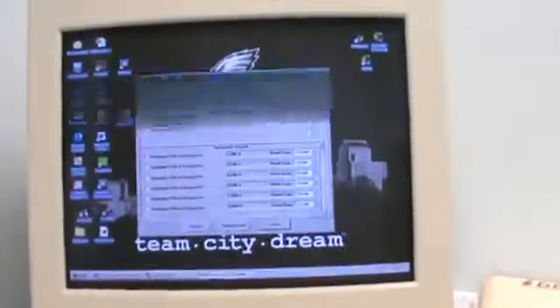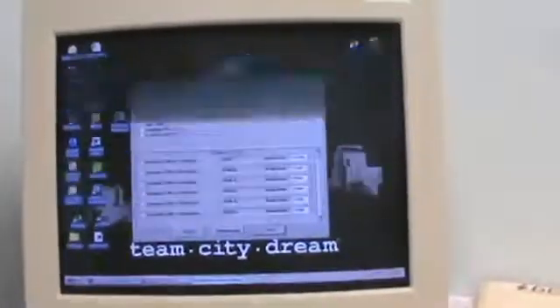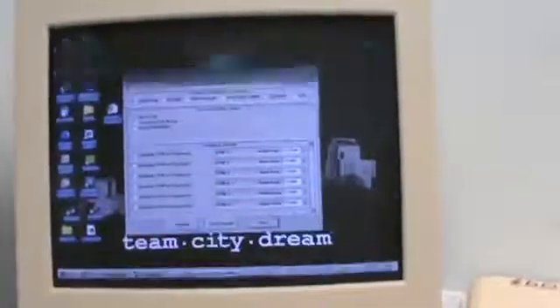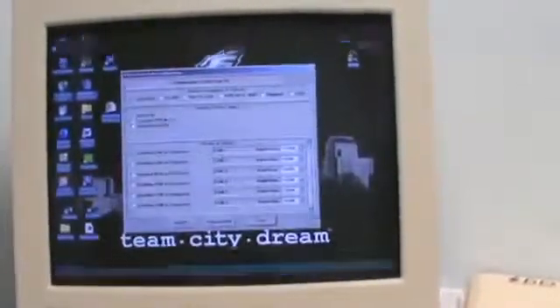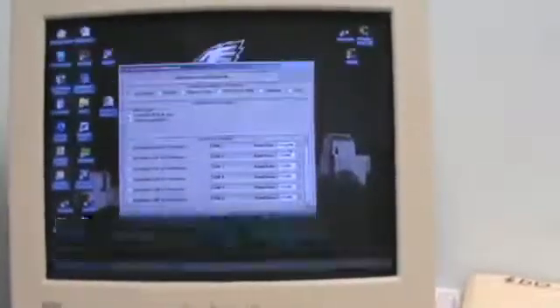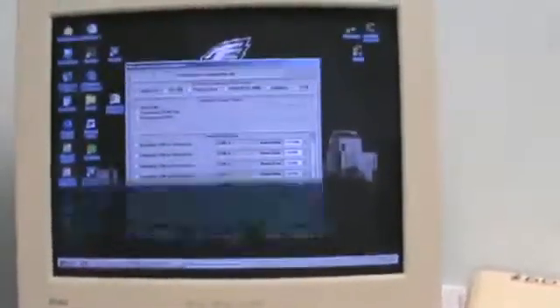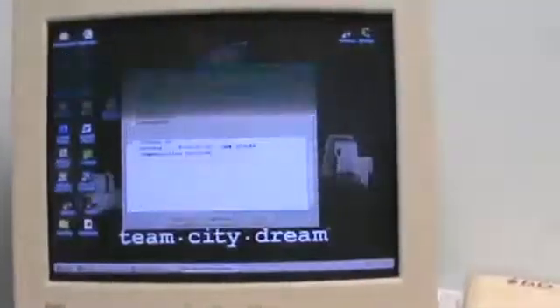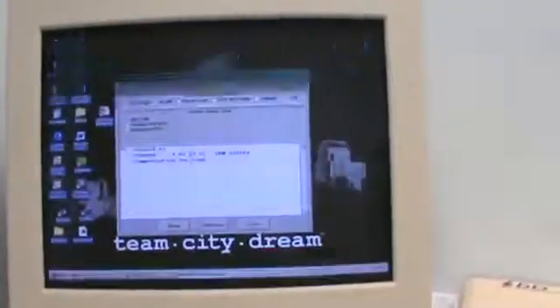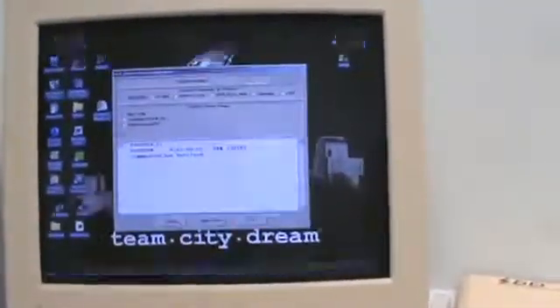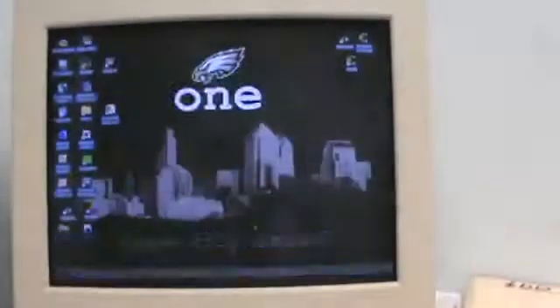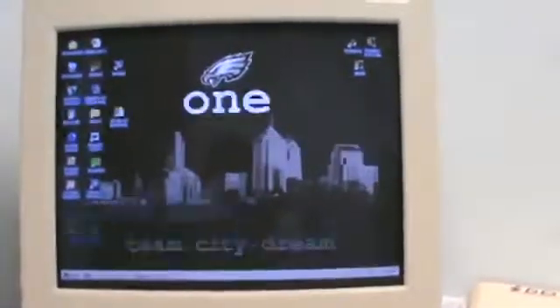Click on hardware search, serial port, ANS output. Typically it will be on COM1. Select the highest baud rate. Click on update. Communication verify. You can close. Now you can open Excalibur.